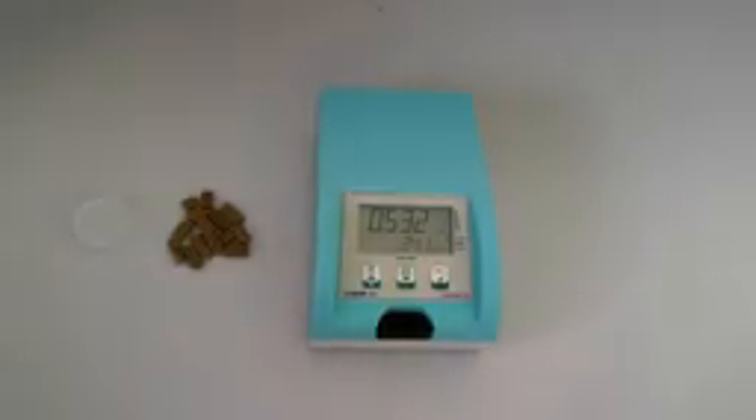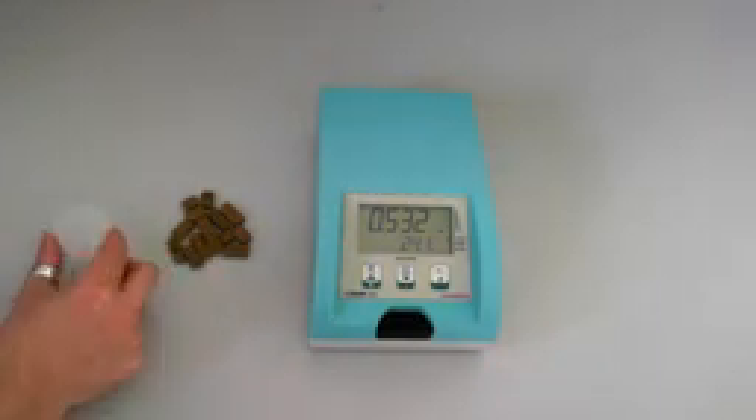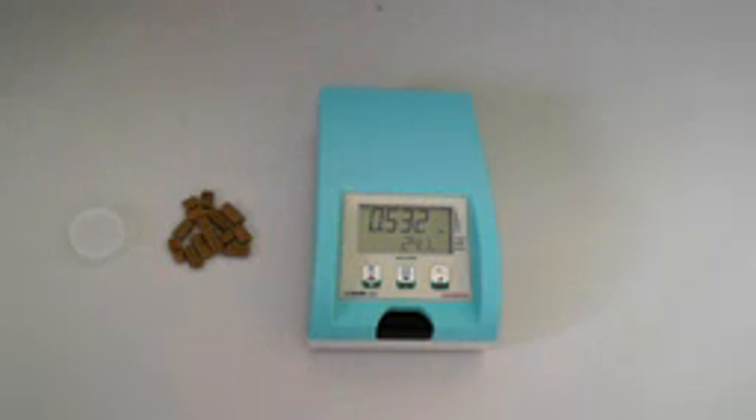Hi everyone, this is a short video about the working principle of the Lab Swift water activity meter once pet food samples are measured. What you need to measure those kinds of samples is a sample cup, some sample — here it's some extruded and pressed pet food — and the Lab Swift water activity meter.